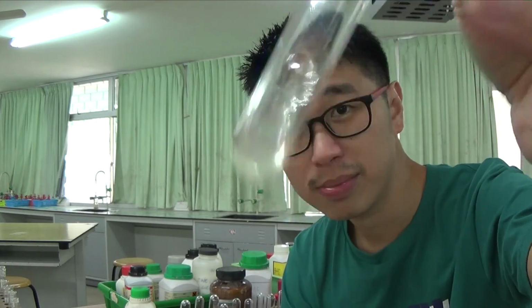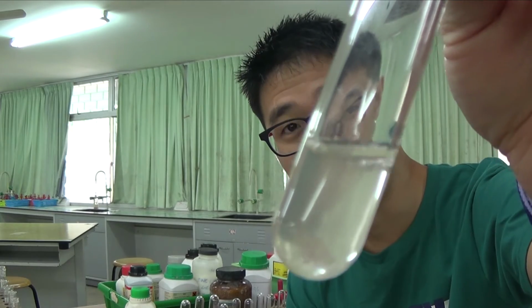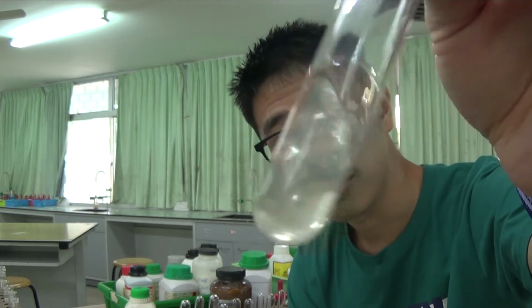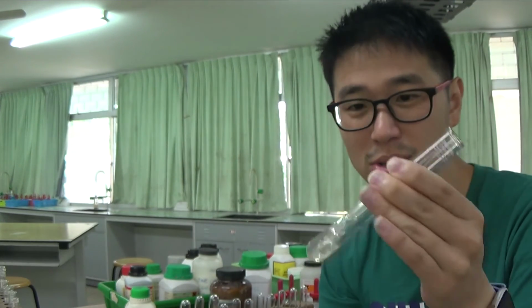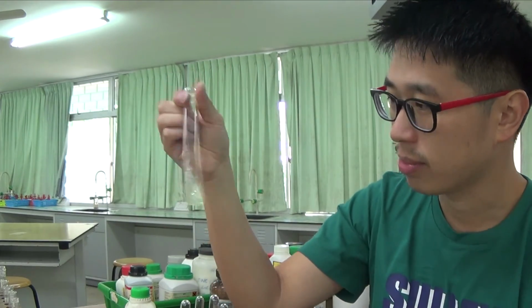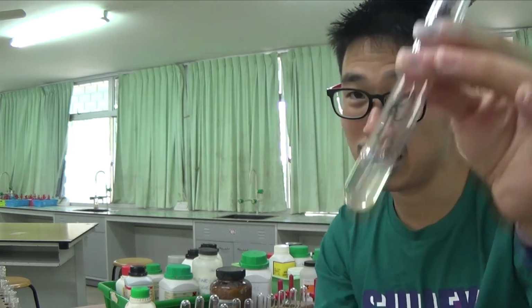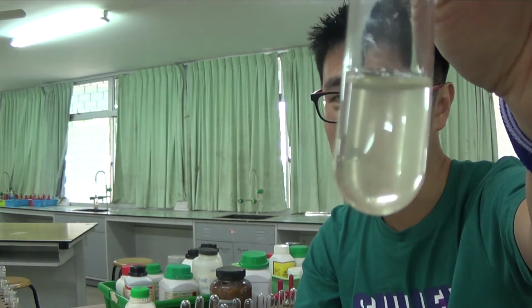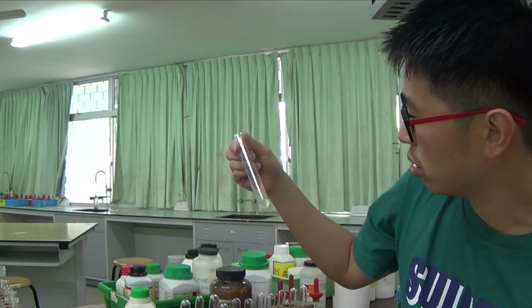This is in water. So it's meant to be a bit pale green in water, but I think the sample is really old, so I'm not sure whether it will work or not. I'm sure the majority of it is still iron(II), but as you know, iron(II) can get oxidized to iron(III). As a solid, I don't think it's that quick, but I've got a solution, so it's a bit colored, but again, color like this is very difficult. It's supposed to be a clear solution. All ammonium salts are soluble in water.